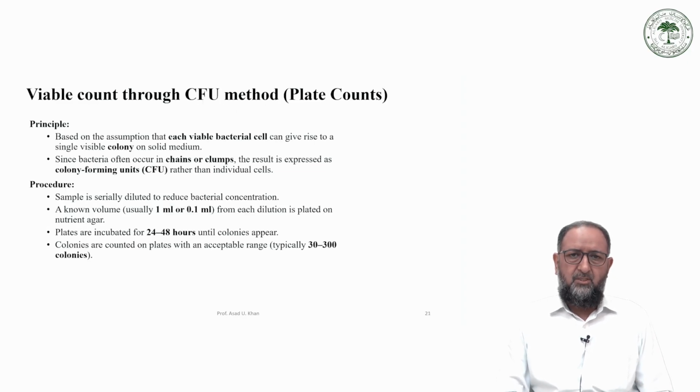Now this is the viable count method, the CFU method. I think the CFU method is the most appropriate and highly used method in the field of microbiology for the quantification of cells.